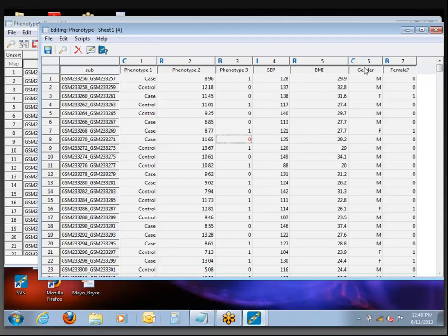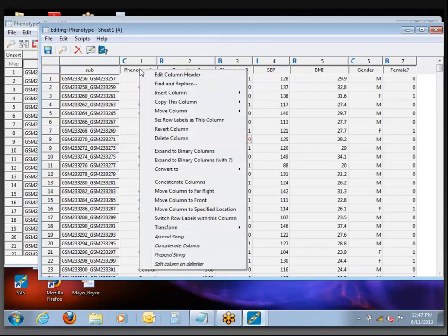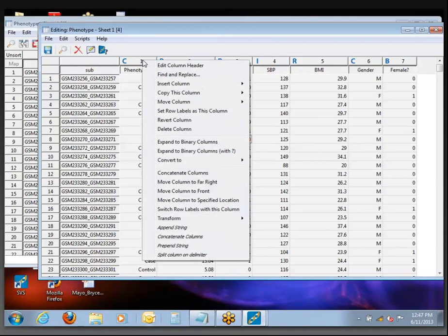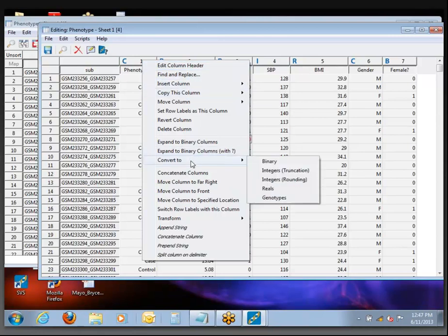There are some different automatic types of things you can do. If you come up right to the top of Column 1 where it says Phenotype 1 and right-mouse-click — on Macs use Ctrl-click — or if you just normal-click right on the column number instead of the column name, you get the same action as right-clicking. By clicking on the column number, you see, for example, this option to convert to binary. This is the one I used earlier today.